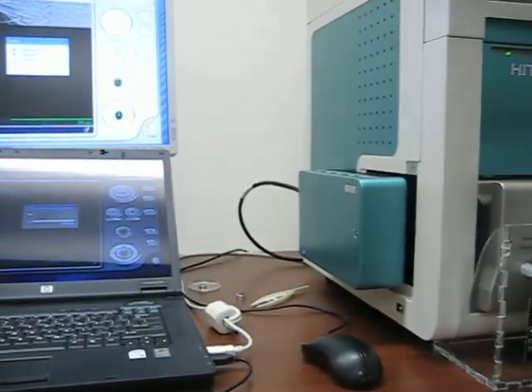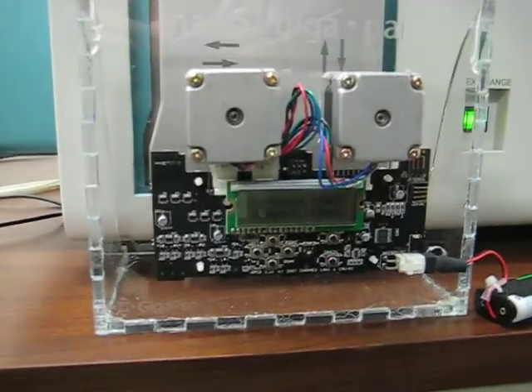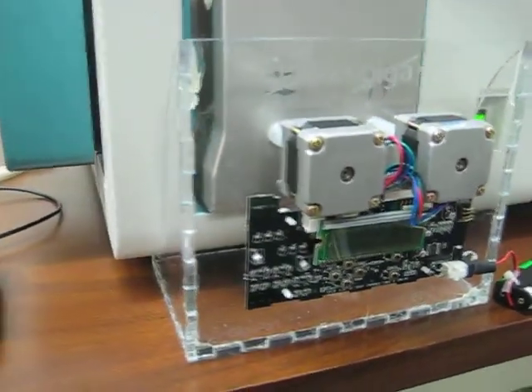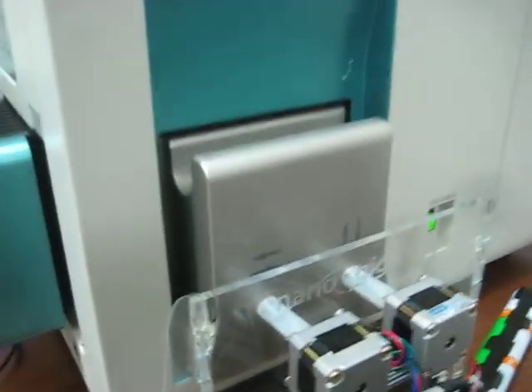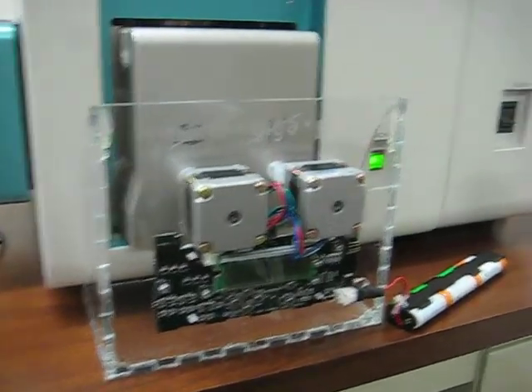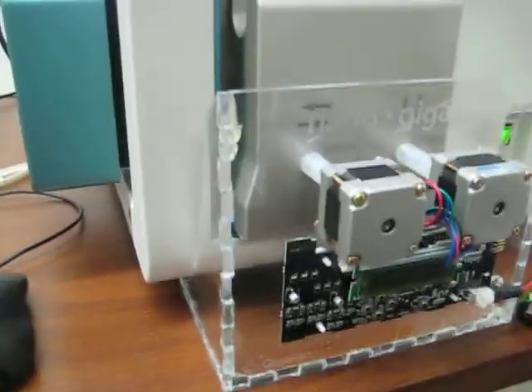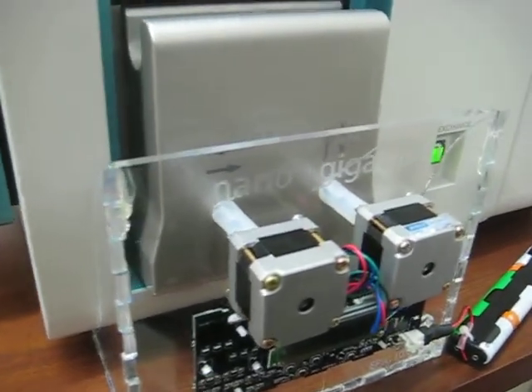This is the first example of the Nano GigaPan. It's composed of a standard disassembled GigaPan unit, made from laser-cut acrylic pieces, and attached to a Hitachi desktop SEM. Normally a GigaPan has a pan and tilt, but we've taken these stepper motors and brought them out to the X and Y translation on the sample holder.